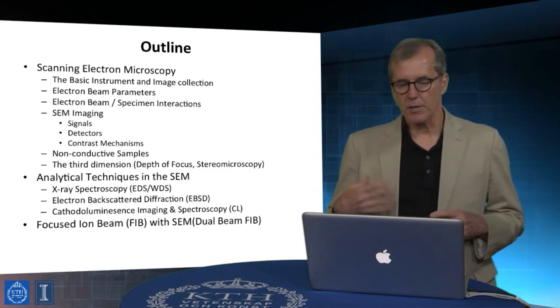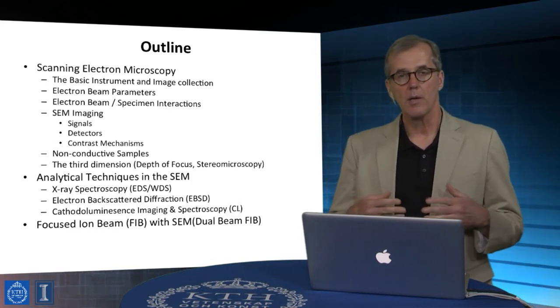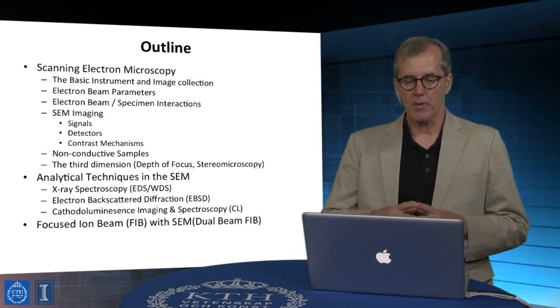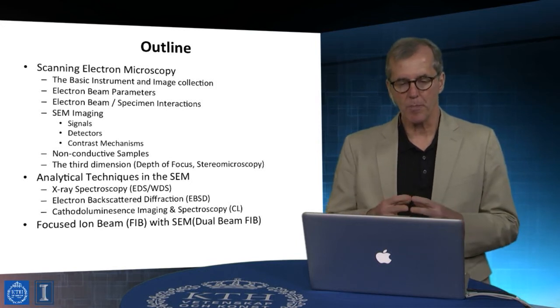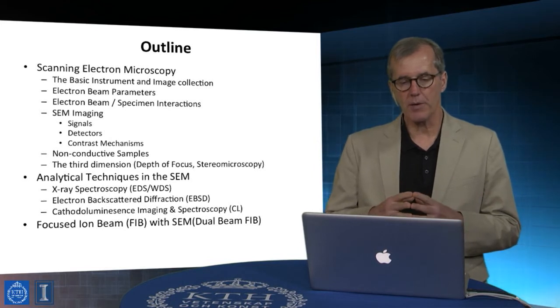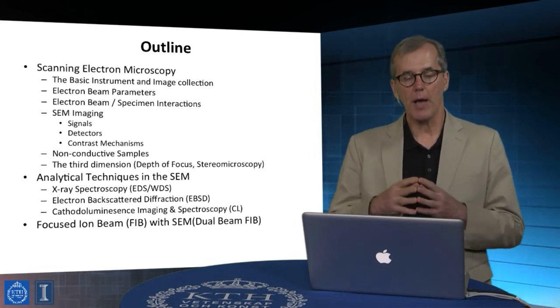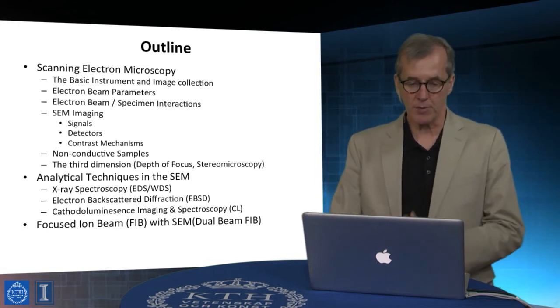We're going to cover a number of different ideas in this lecture, which will be presented in two parts. We'll speak first about the design and operation of an electron microscope, and in particular the detection elements that render the ability of electrons to capture topological and important compositional information about a material sample.